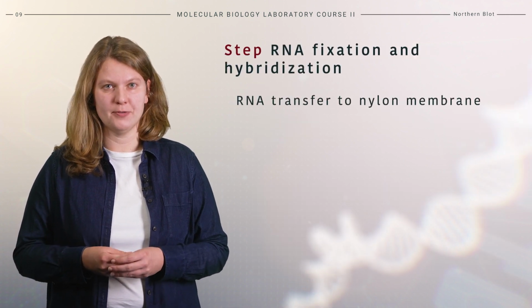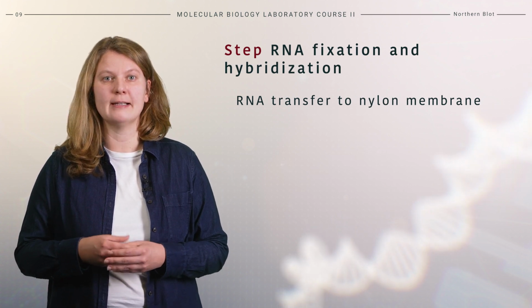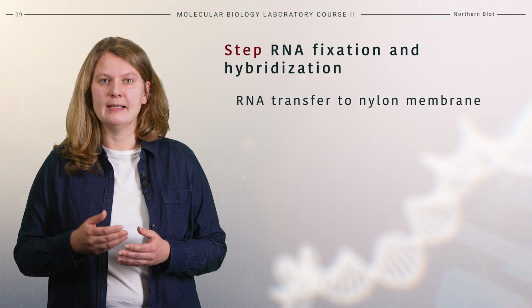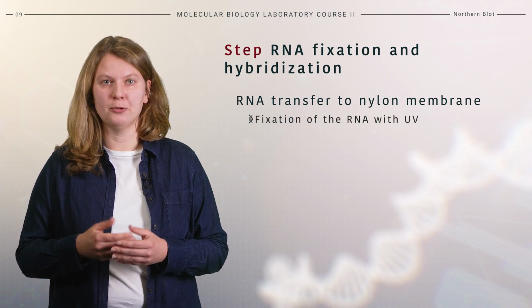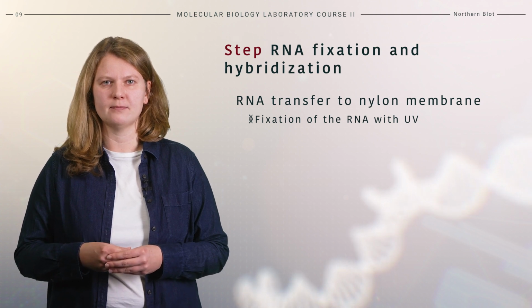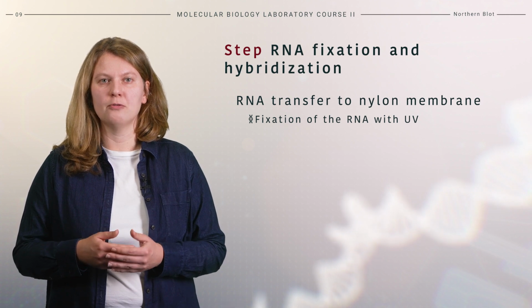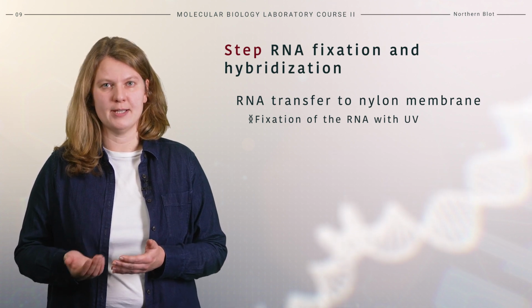After the capillary transfer, RNA molecules are immobilized on the membrane through covalent linkage. The linkage is achieved by exposing the membrane to UV light or by heating it to around 80 degrees Celsius. It is crucial to immobilize RNA molecules to avoid losing them during the subsequent processing steps.